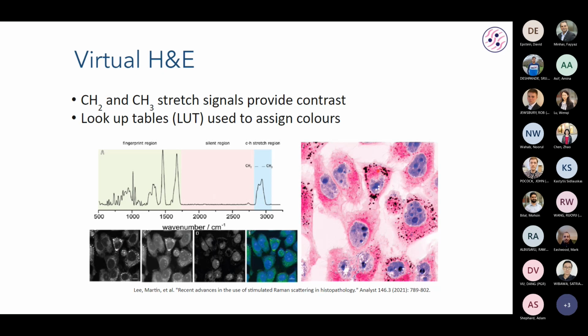Maybe it's a clump of genetic material, because where you have more DNA, you would have more of these bonds. So maybe these are just clumps of proteins, or DNA. I don't know for sure. This is just my guess.